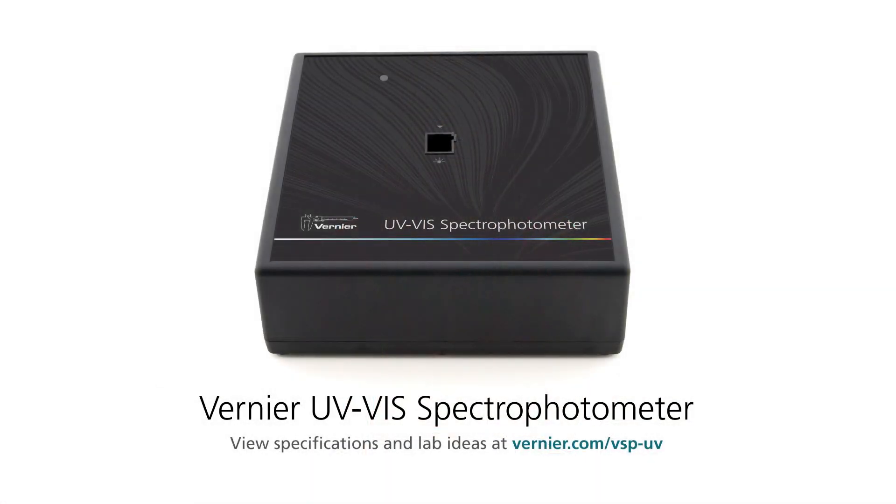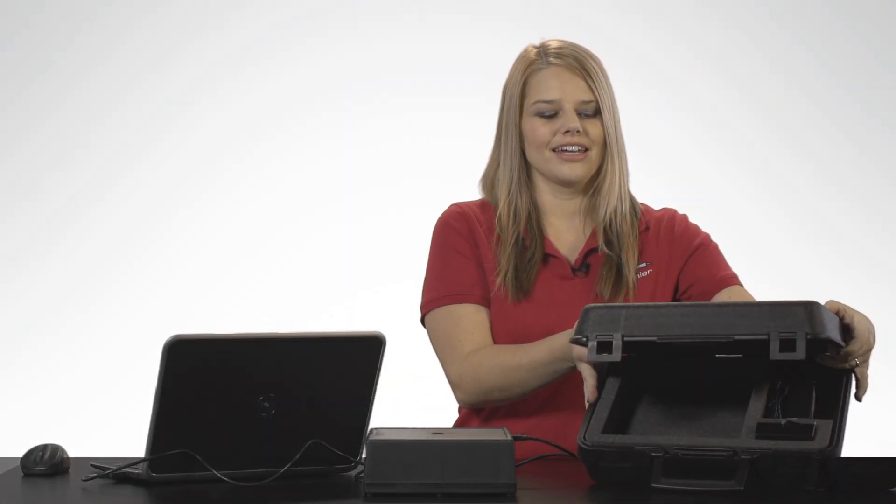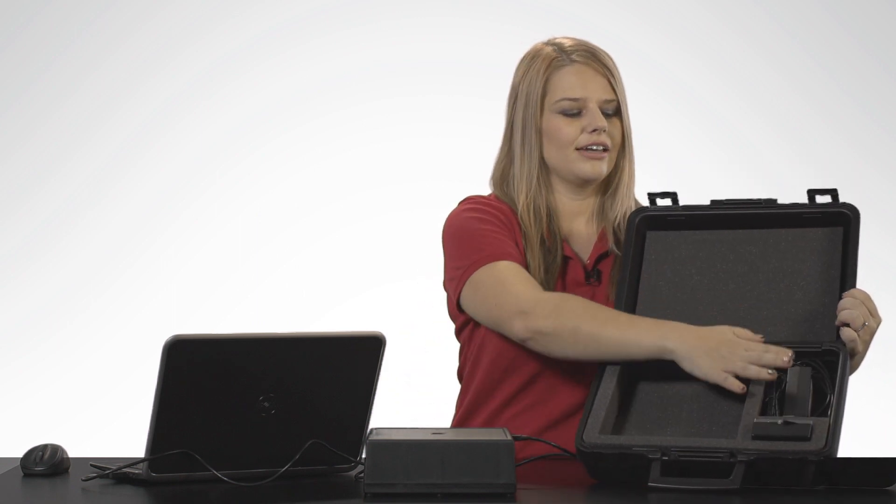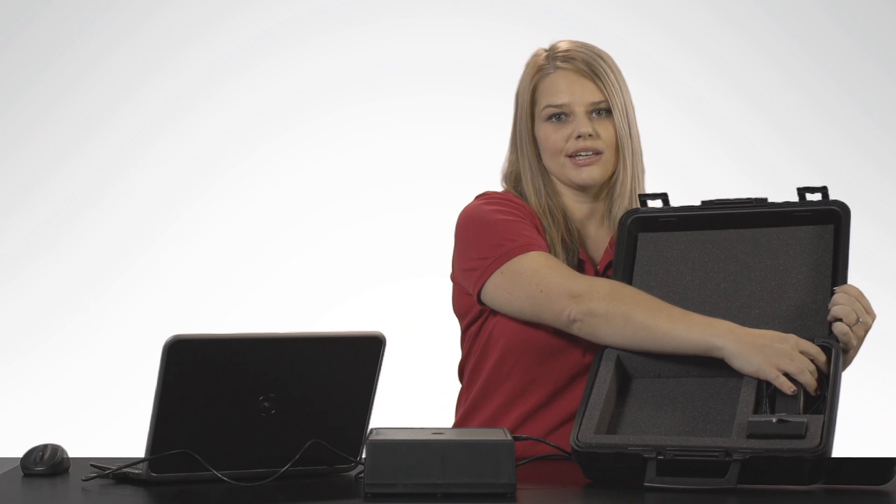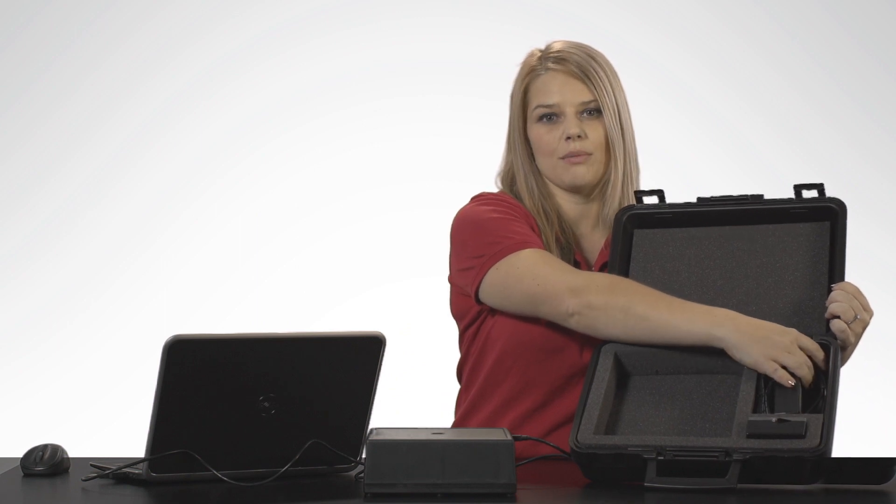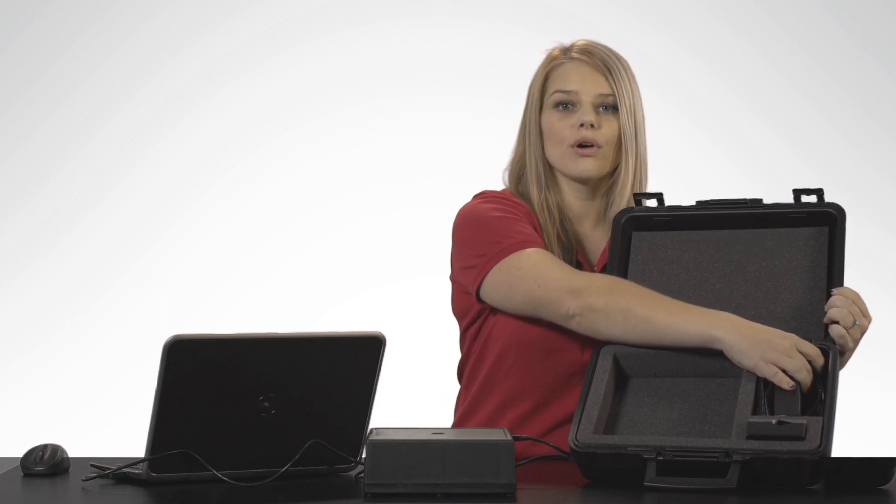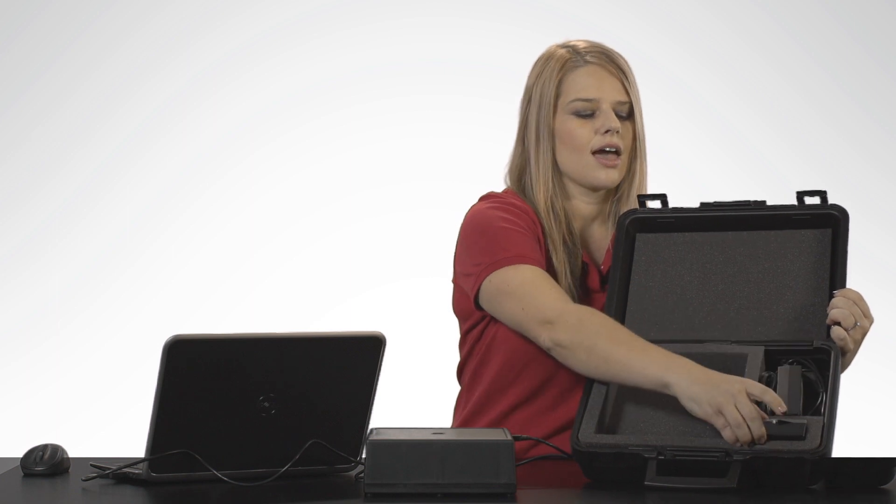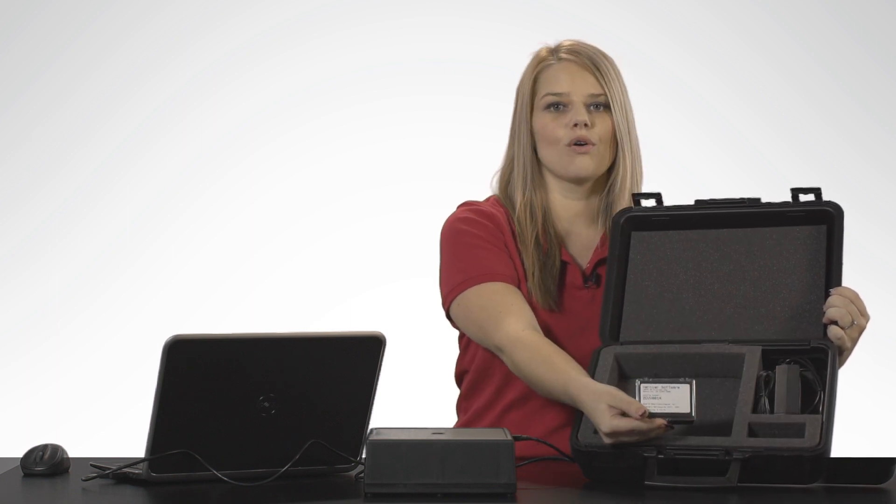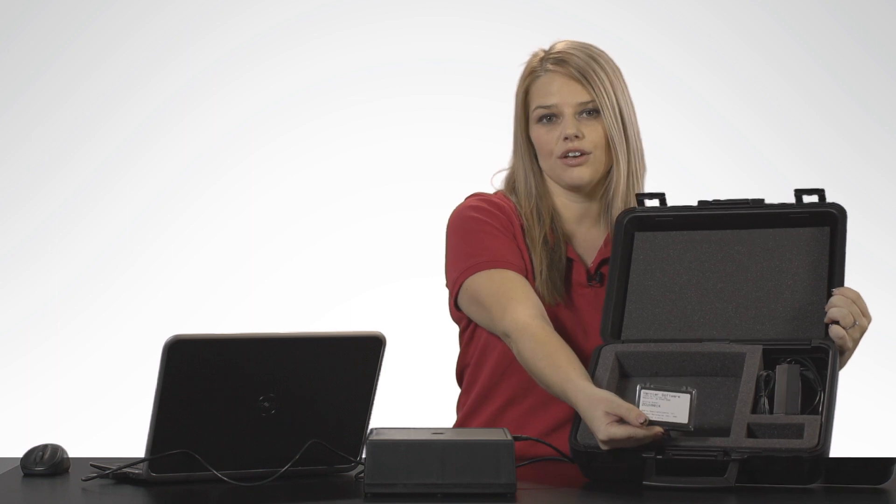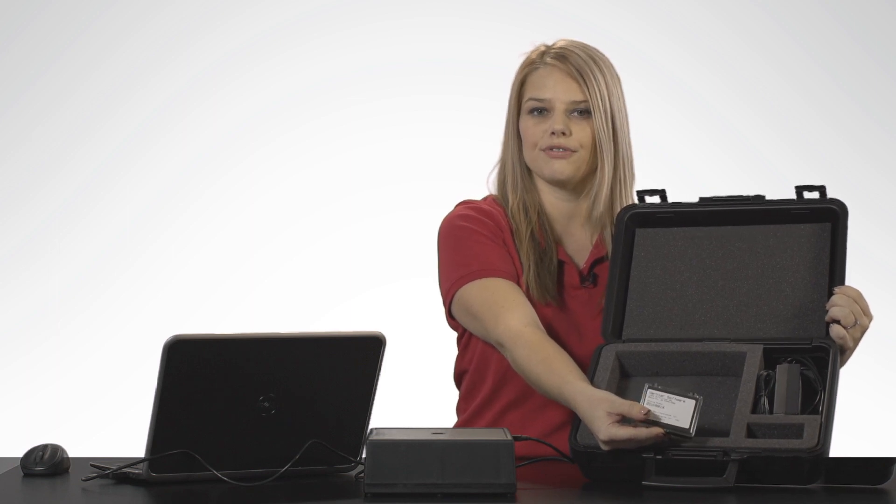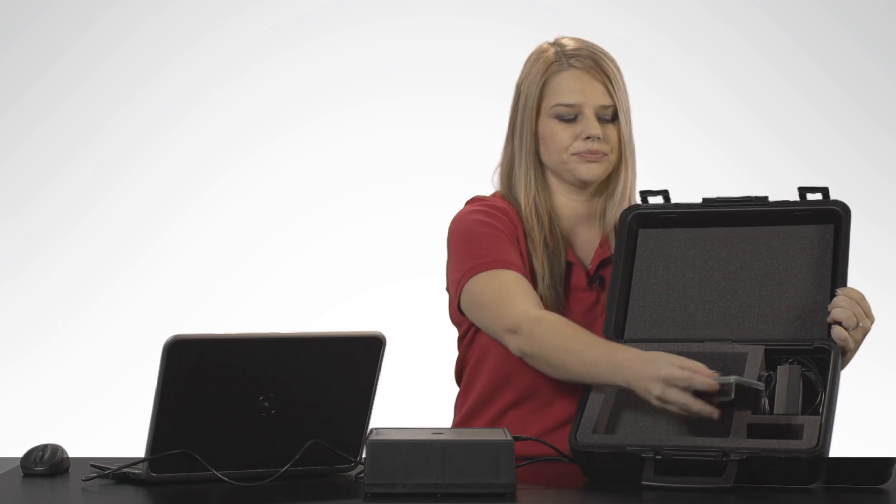Today I'm demonstrating how to use the Vernier UV-Vis spectrophotometer. When you purchase the spectrometer, it comes in this nice carrying case, and inside is the spectrophotometer, an AC power supply, a USB cable that connects the spectrometer to a computer or to a LabQuest, and a set of two Starna quartz cuvettes. These are the cuvettes that you're going to want to be using for experiments like I'm demonstrating today.